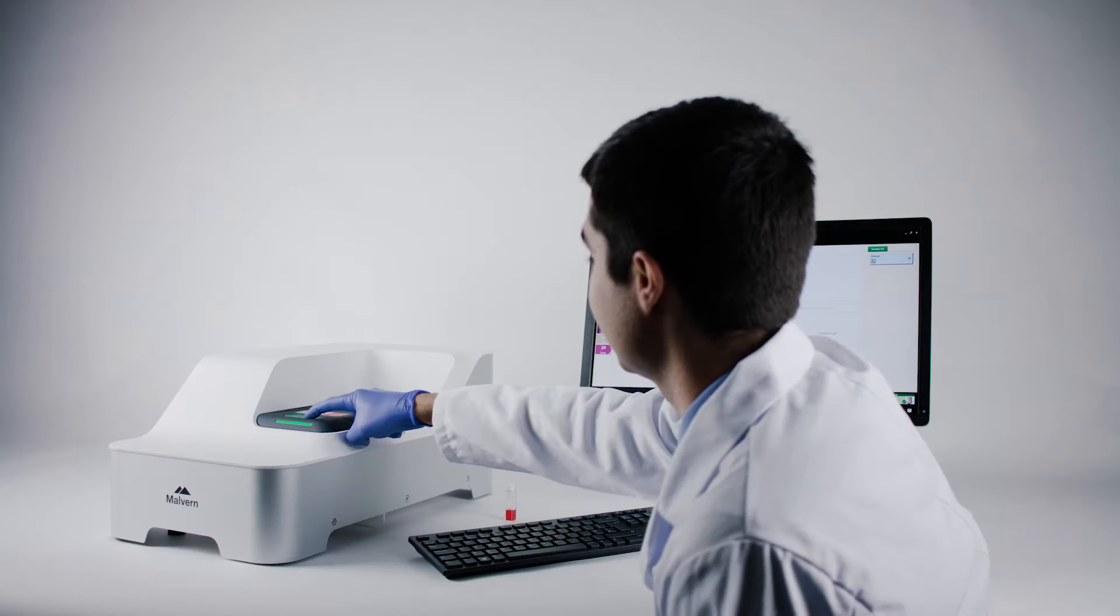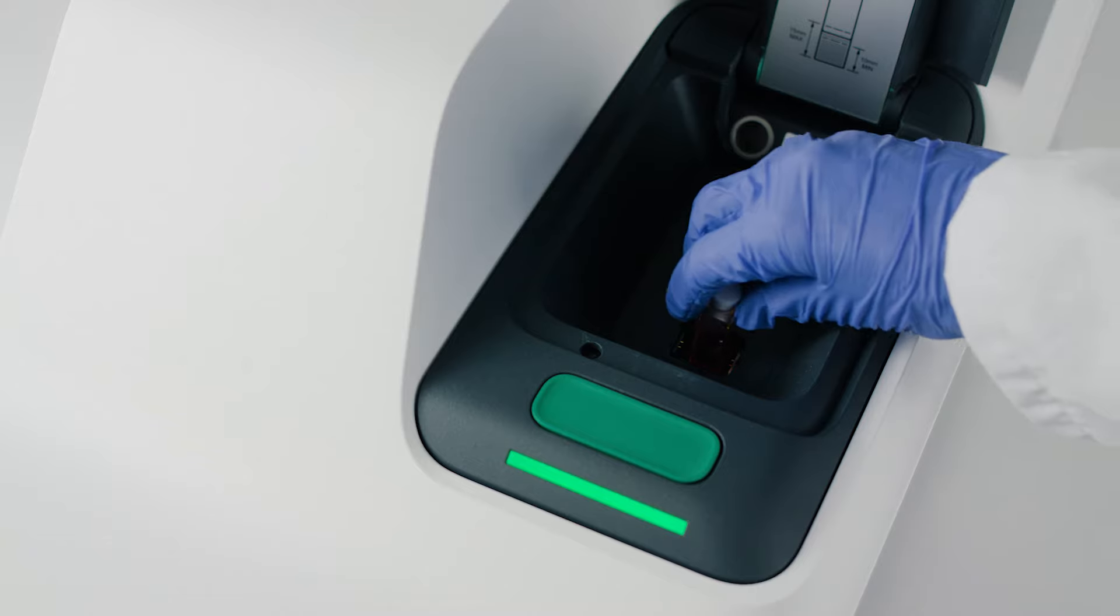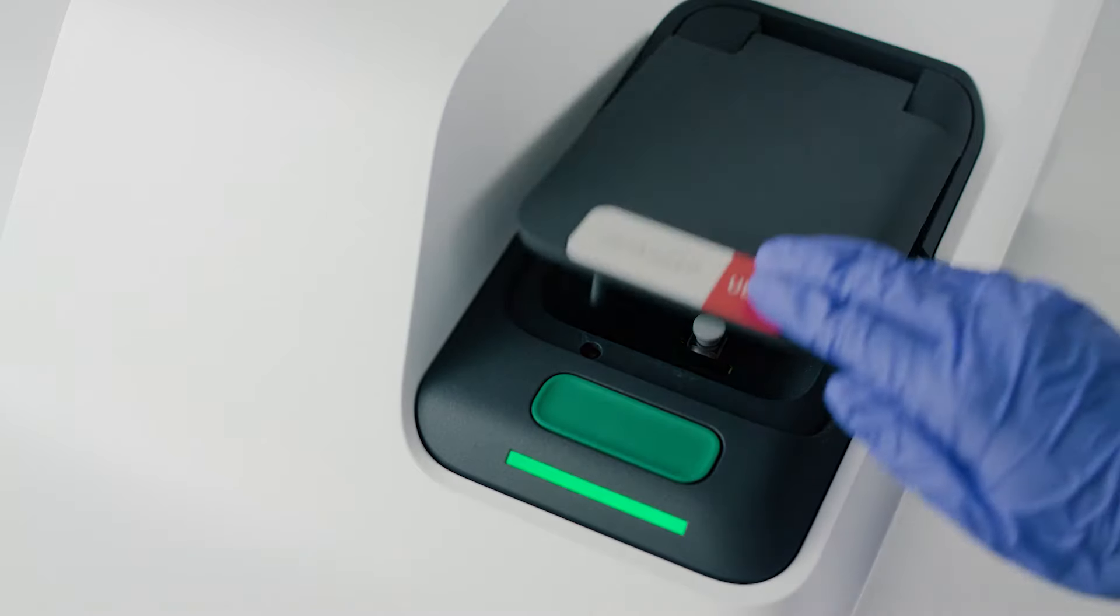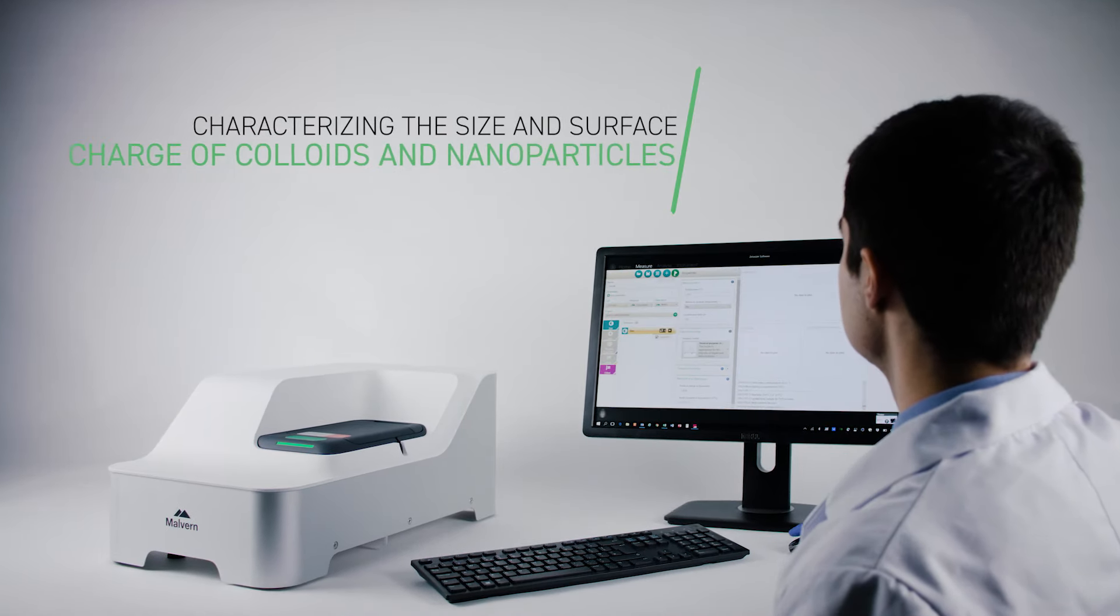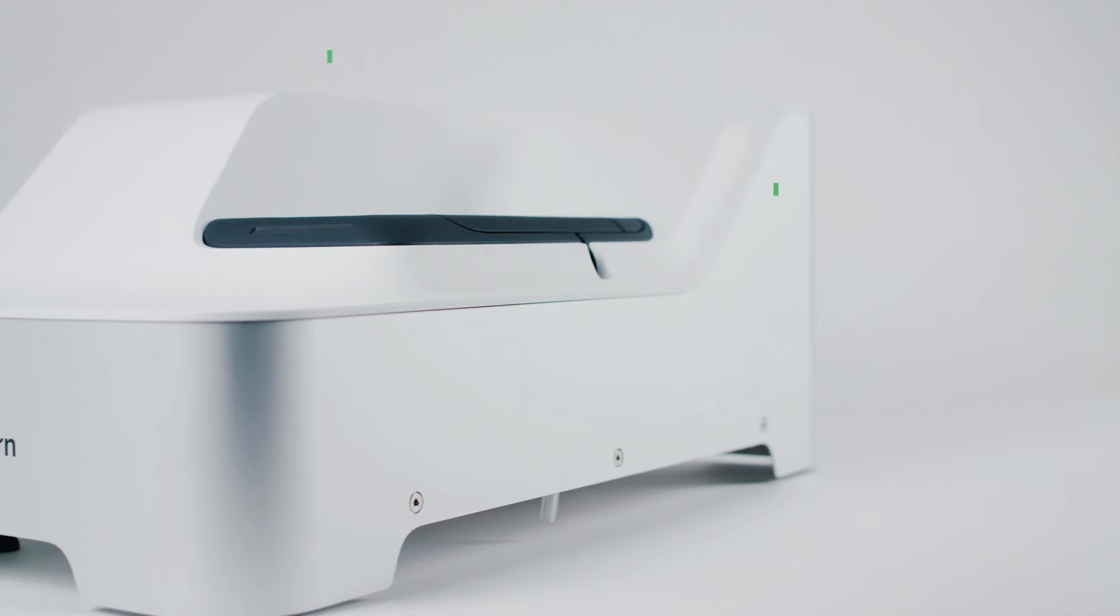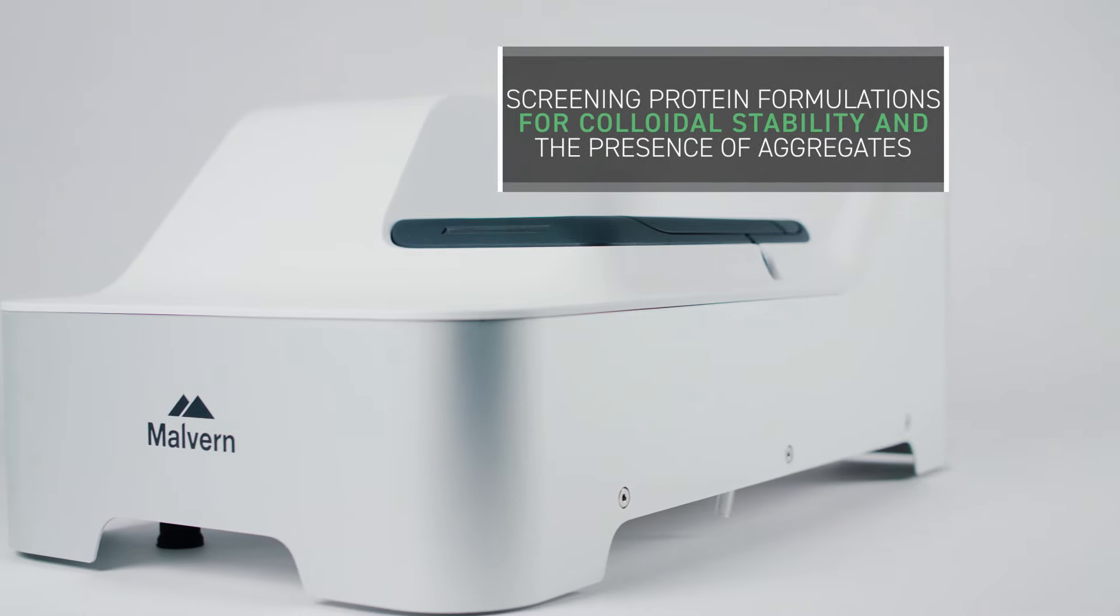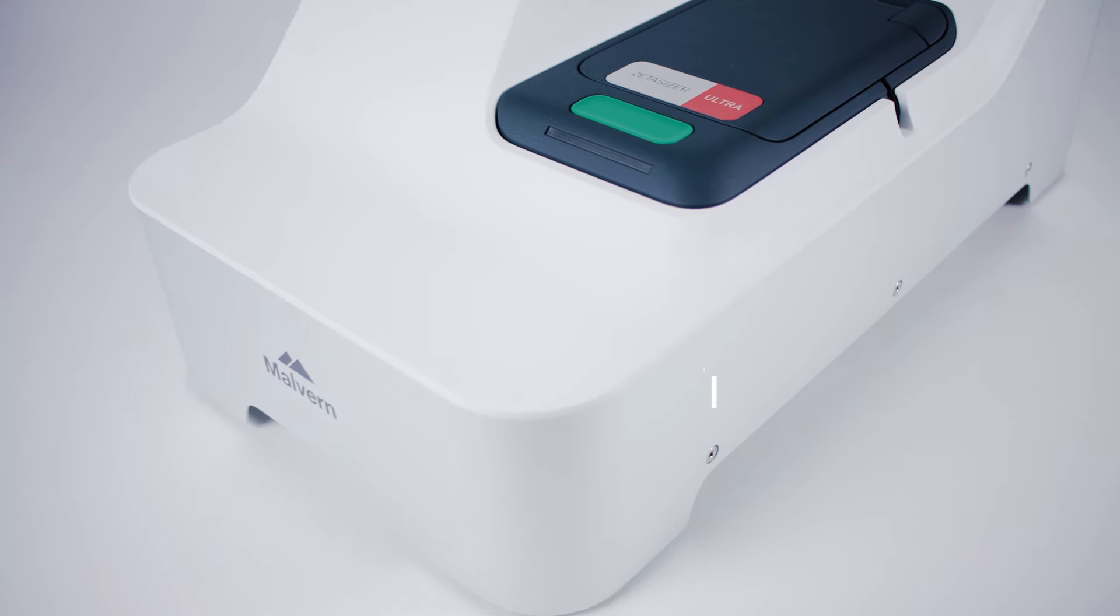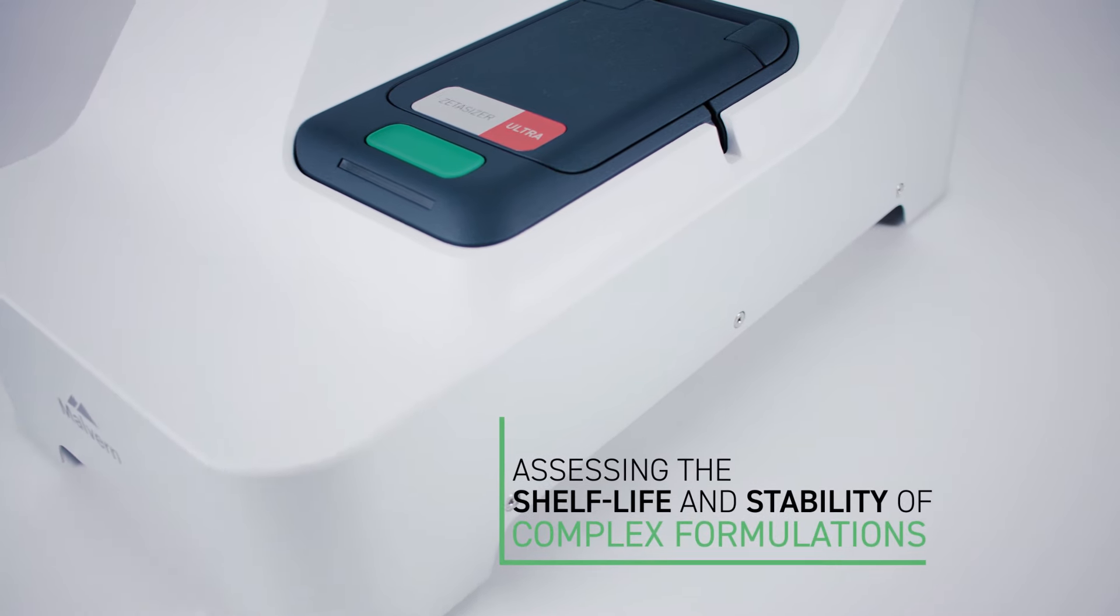The ZetaSizer Pro and Ultra find use in a wide range of industries and applications. Examples include characterizing the size and surface charge of colloids and nanoparticles, screening protein formulations for colloidal stability and the presence of aggregates, and assessing the shelf life and stability of complex formulations.